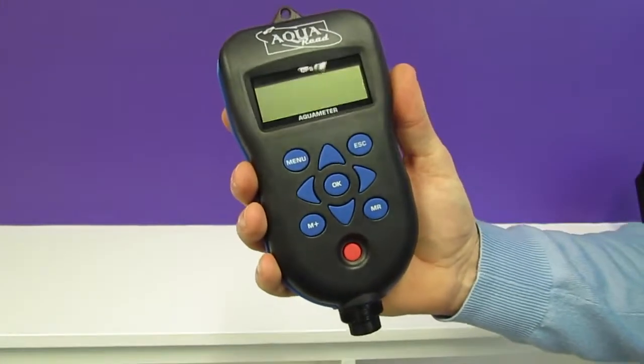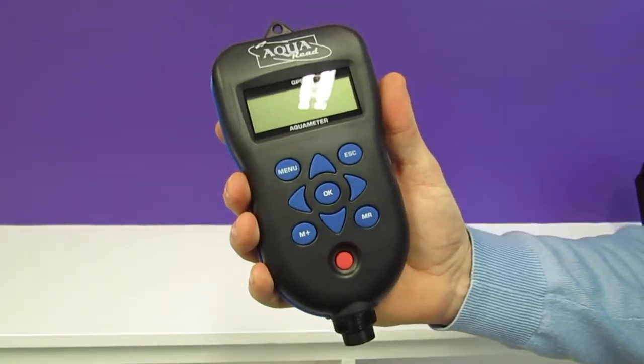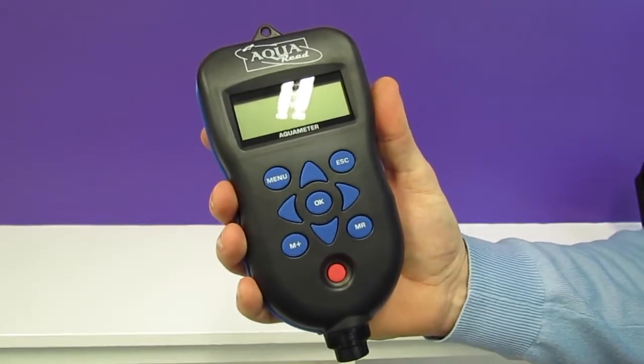This is our GPS Aquameter, the original water quality meter to feature a built-in GPS receiver.